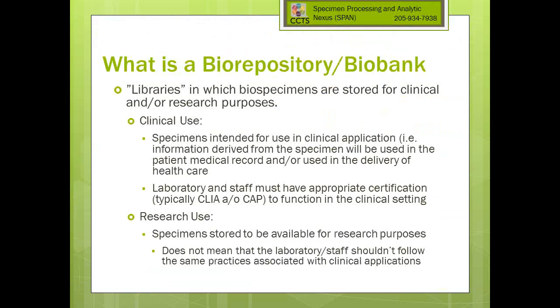There we go. So maybe the first question, what is a biorepository or a biobank? Well, it's really a library in which specimens are stored for clinical and or research purposes. And it's important to keep the distinction between clinical uses and research purposes because there's a lot of different regulations that get invoked if you start to talk clinical applications for any of the specimens that are stored in a biobank.